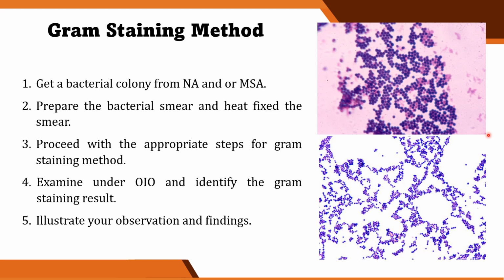Okay, next. It is not enough that we culture it. Although we have an idea that it is golden yellow when it grows, we cannot say right away that it is that organism. So we still have to test it to confirm. One thing we always need to do is Gram staining. You already know the procedure for that. As for the expected result, since it is Staphylococcus, it is gram positive, usually in clusters. That is how it looks. It can be single cocci, but usually they are in clusters.